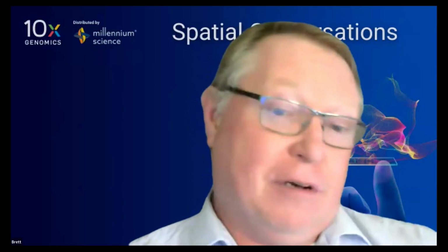Yeah, I can say that we do get this question a lot too, so it's a good one to quickly touch base on. Our informatics group's position is that the algorithms around spatial analysis are changing and developing quite rapidly at the moment. That is true. And the feeling is that at this point in time, we don't feel confident that there's necessarily a best in class. And so we're recommending that people look at the different algorithms and what's appropriate for their own work as third-party tools. We're not planning to develop those in-house at the moment. But of course, it's changing rapidly. That could change as well.